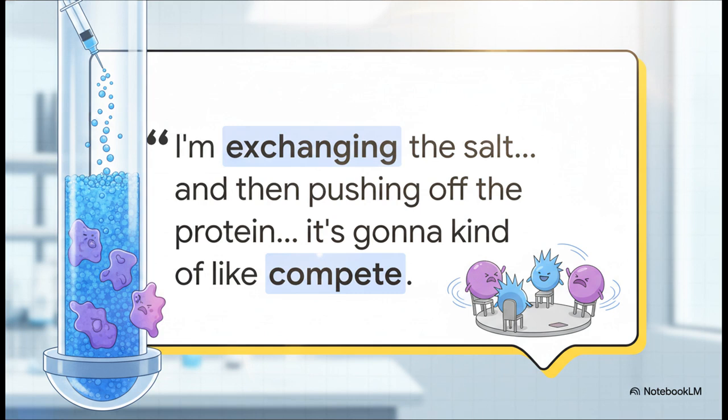I absolutely love this quote from a biochemist describing the process. They said, "I'm exchanging the salt and then pushing off the protein with the salt. It's going to kind of like compete." You see, elution is essentially the ultimate chemical game of musical chairs.